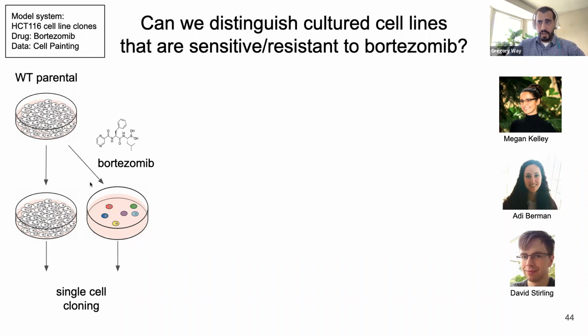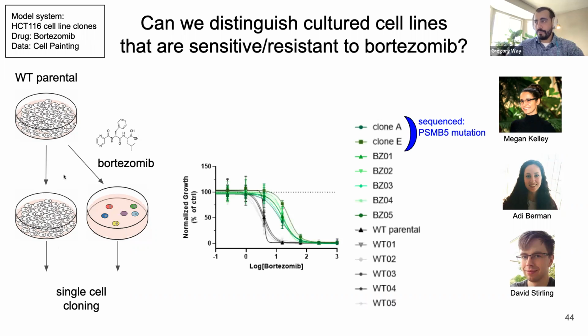So if we treat it, we can identify these colonies that are resistant to bortezomib, and we can proceed with resistant colonies and non-resistant colonies through single cell cloning to generate a bunch of different biological replicates of the parental line. And just as a test to make sure that our procedure is working, we generated 5 resistant lines, at least in this figure, we have since generated many more, plus these 2 historical lines, which we know have the specific mechanism through a PSMB5 mutation in the proteasome subunit.